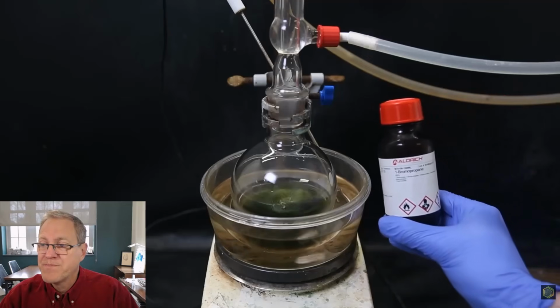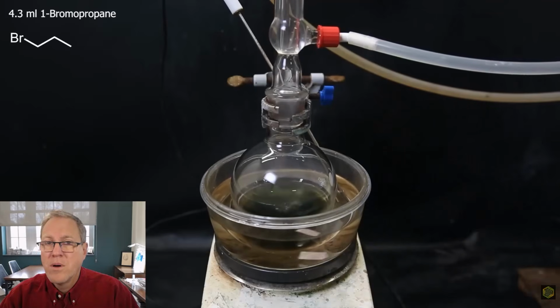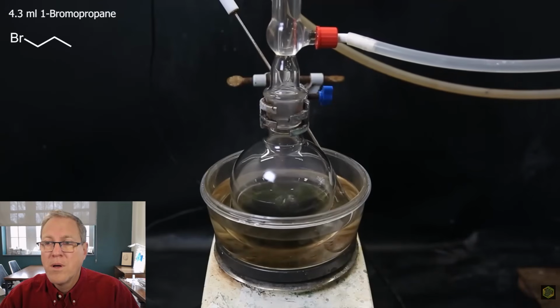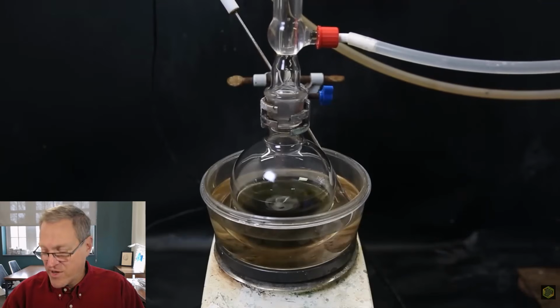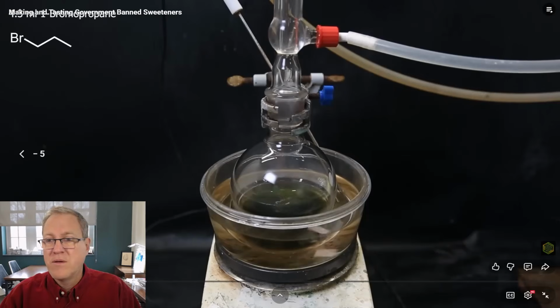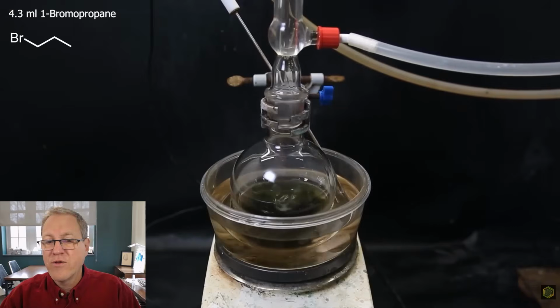It's 1-bromopropane, of which I will add 4.3 mils slowly through the condenser. It becomes darker, and I then leave it to react for 4 hours at reflux. So we can't see this on camera. Let's go back and watch it again. He's just dripping that in the top of the condenser, and the top of the condenser is off the screen. But if you watch, you can see the drips going through the condenser down into his flask.